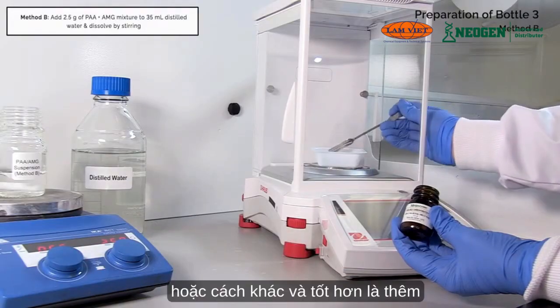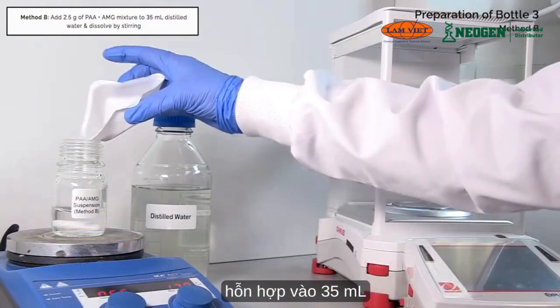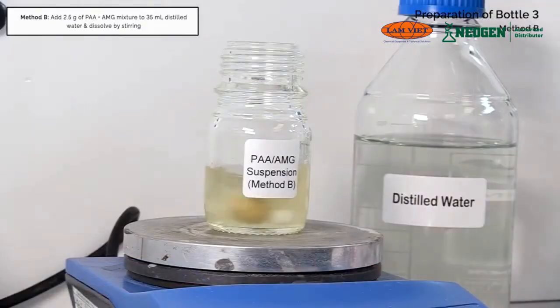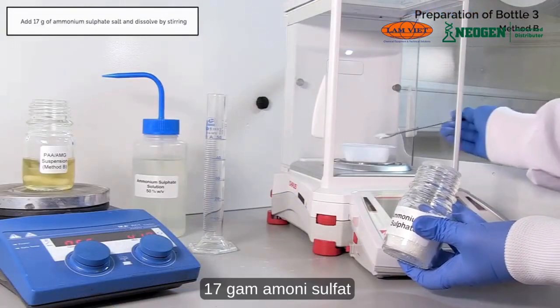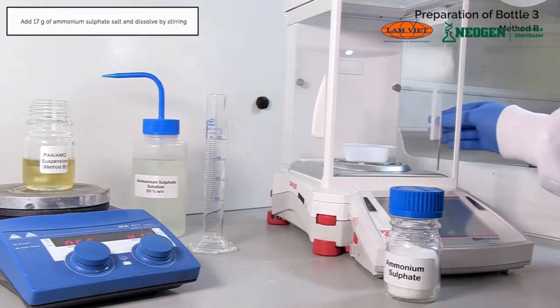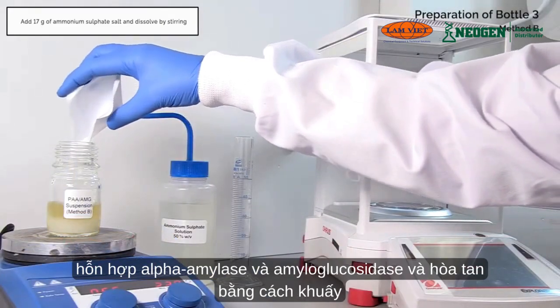Alternatively, and preferably, add 2.5 grams of pancreatic alpha amylase and amyloglucosidase mixture to 35 millilitres of distilled water and dissolve by stirring on a magnetic stirrer. Weigh 17 grams of ammonium sulfate. Add this to the dissolved pancreatic alpha amylase and amyloglucosidase mixture and dissolve by stirring.